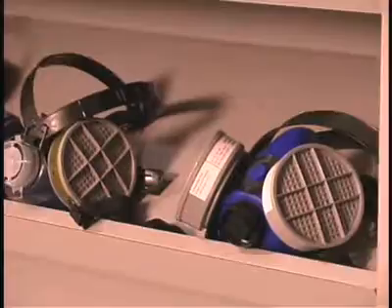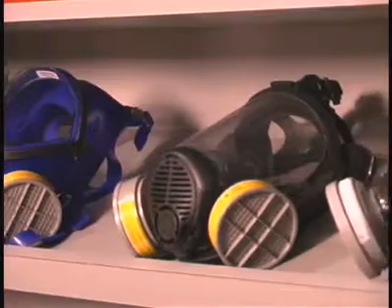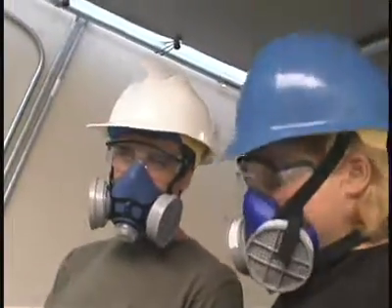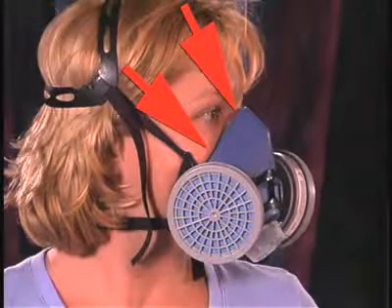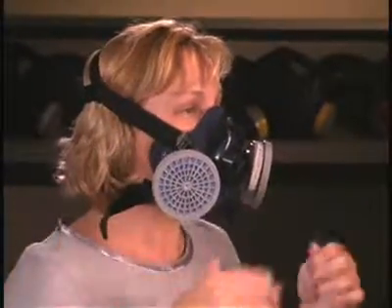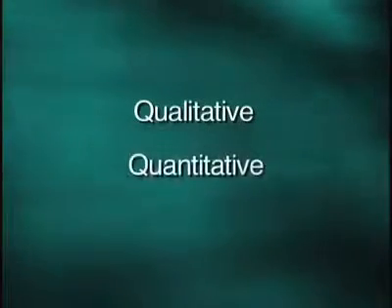Though we'll be using half masks to demonstrate fit testing, the same general practices apply to full facepiece respirators. Individual facial characteristics, such as size or shape, influence the way a respirator fits. Beards, sideburns, or other facial hair can also adversely affect respirator fit. Poorly fitted respirators allow dangerous substances to be inhaled, along with air, through spaces between the wearer's face and the respirator. However, most people can be properly fitted with air-purifying respirators by the use of fit testing procedures designed to evaluate mask-to-face fit. There are two methods of fit testing: qualitative and quantitative.